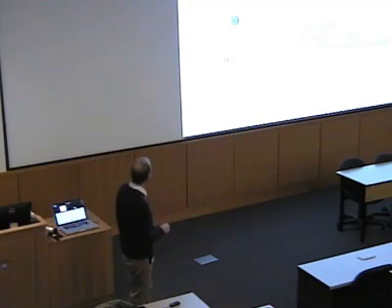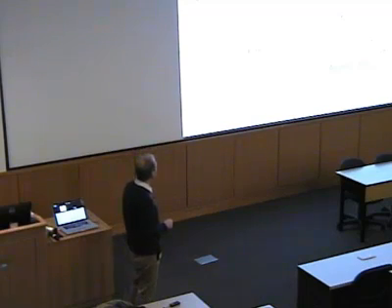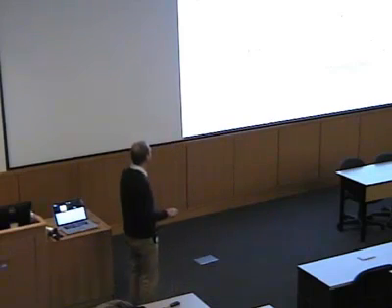Okay, so anyway, we have this magnetic moment, and if we were to place this particle with a magnetic moment into a magnetic field, then the magnetic moment, or the spin vector, can align itself in two possible orientations, right? This goes back to the Stern-Gerlach experiment, which I'm sure you all heard about in your undergraduate courses, that the direction of the spin vector, or the magnetic moment, is quantized in a magnetic field, and so we get two spin states with different orientations of the magnetic moment relative to the field.